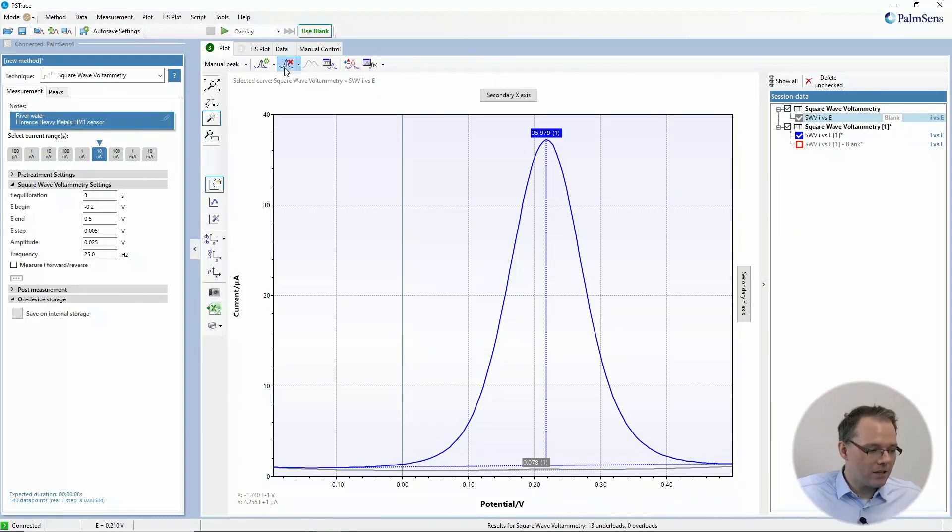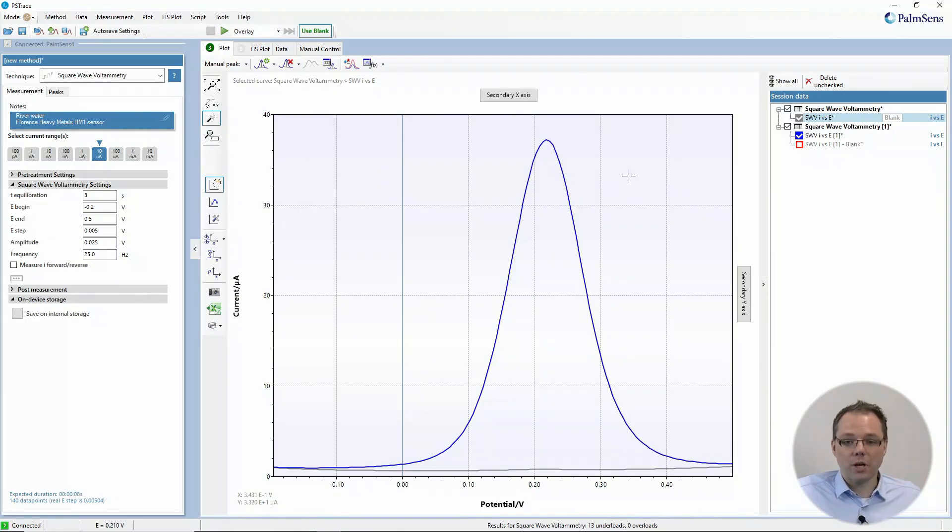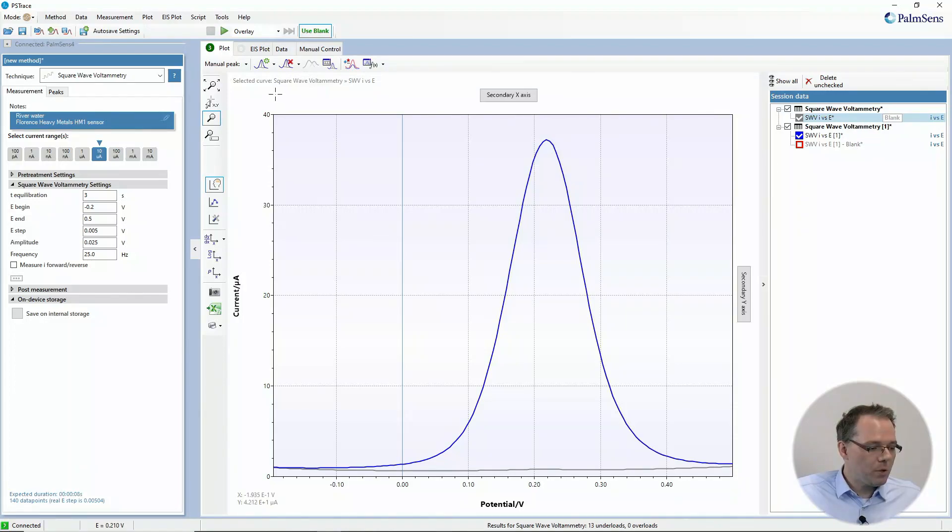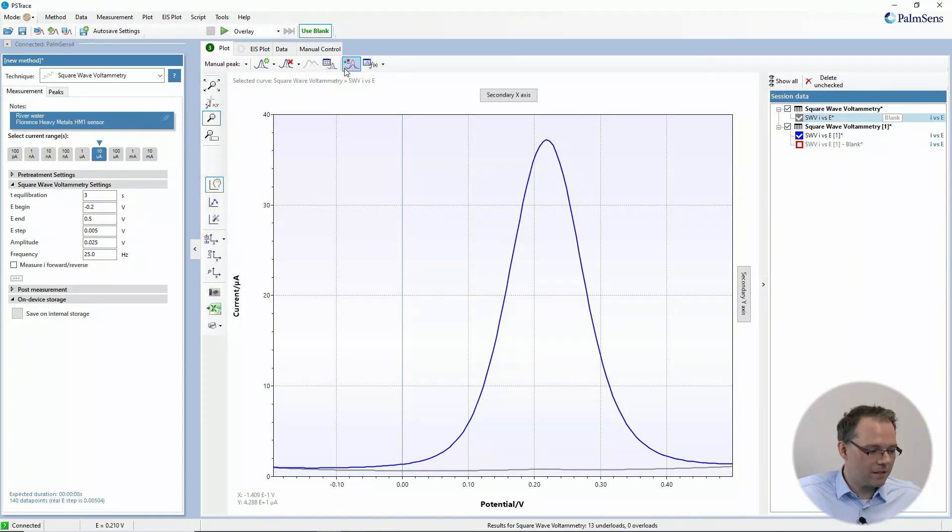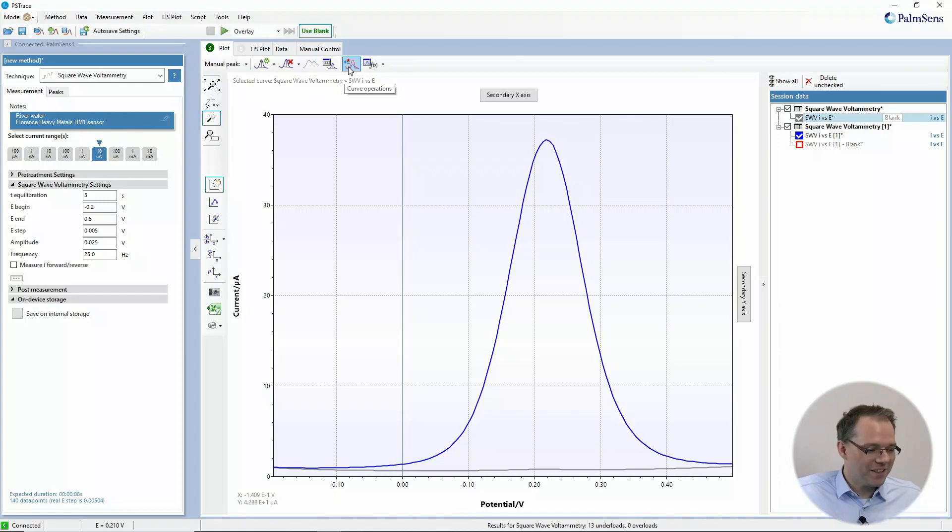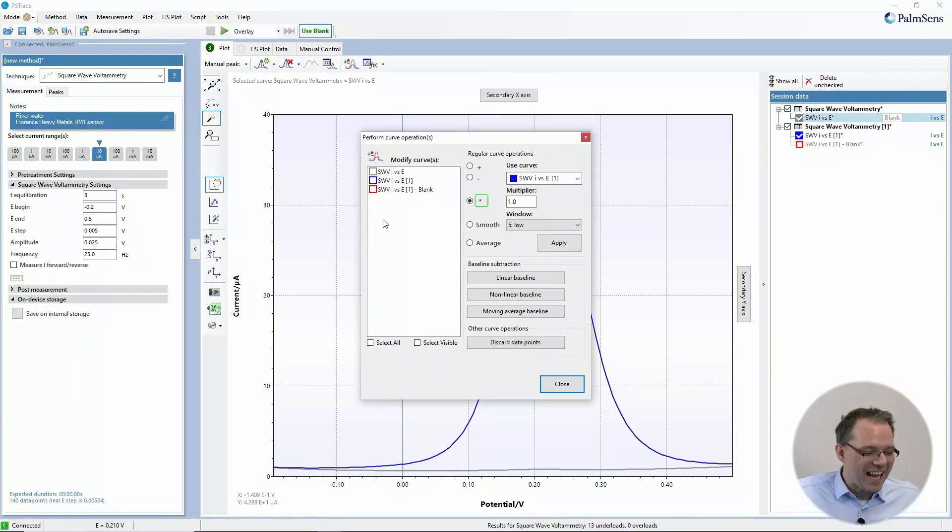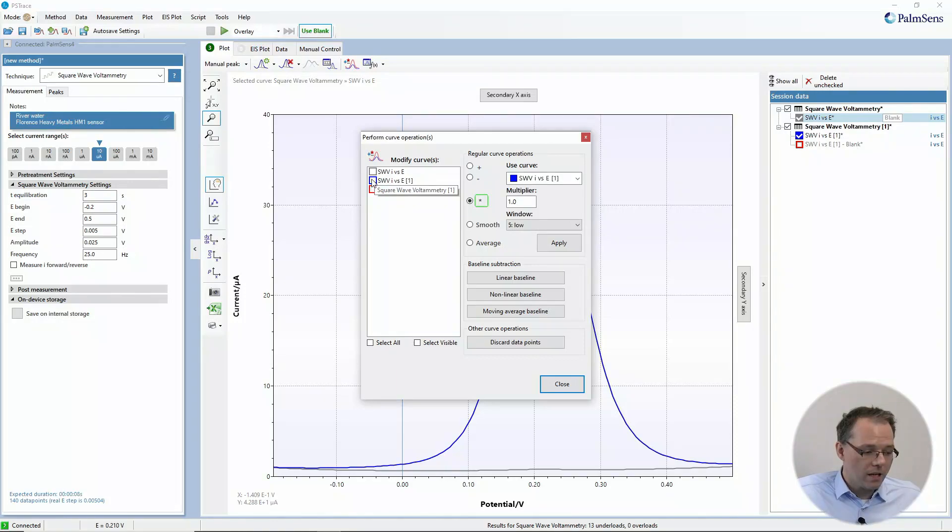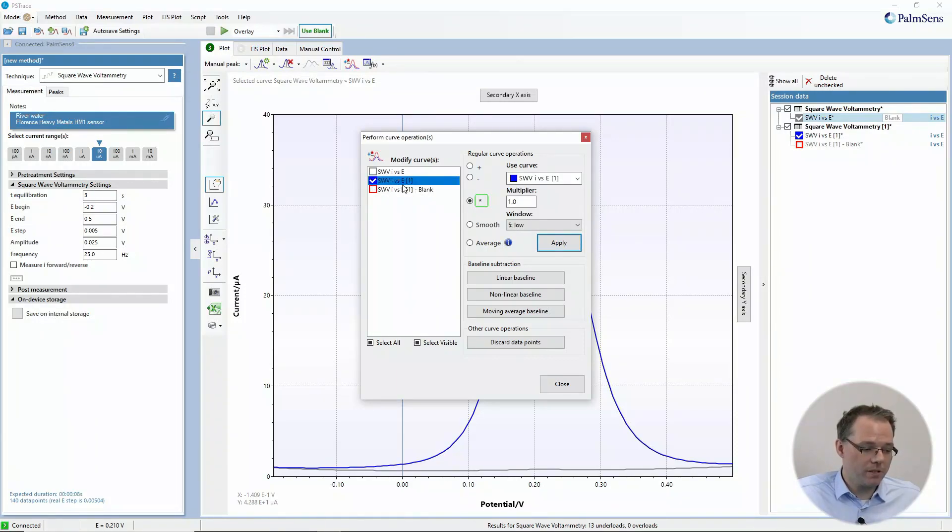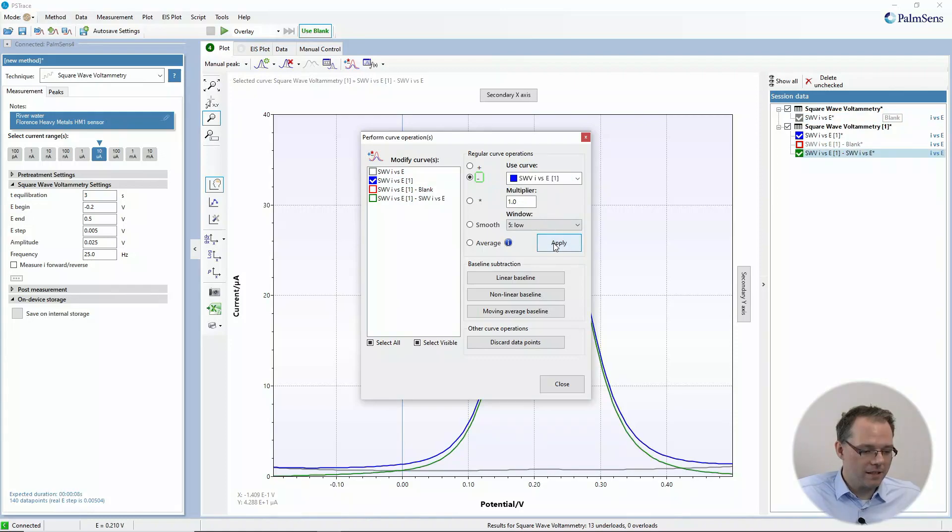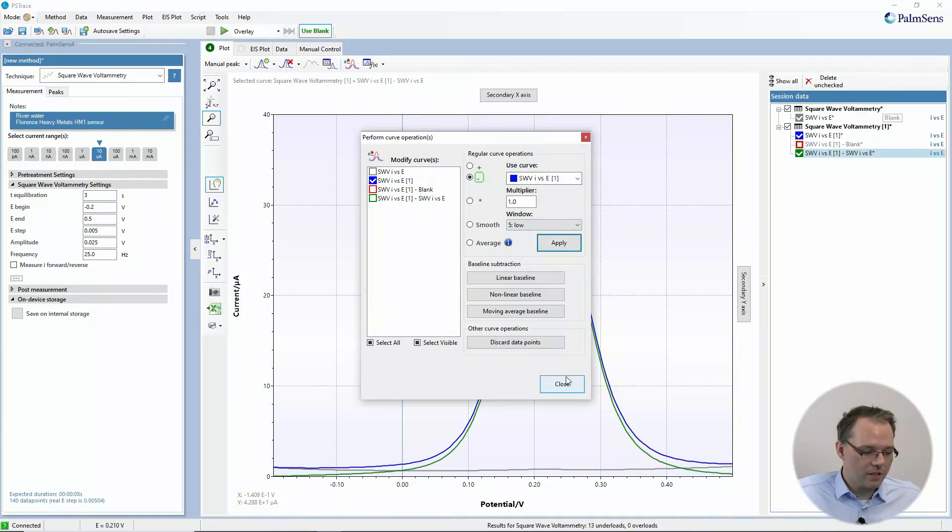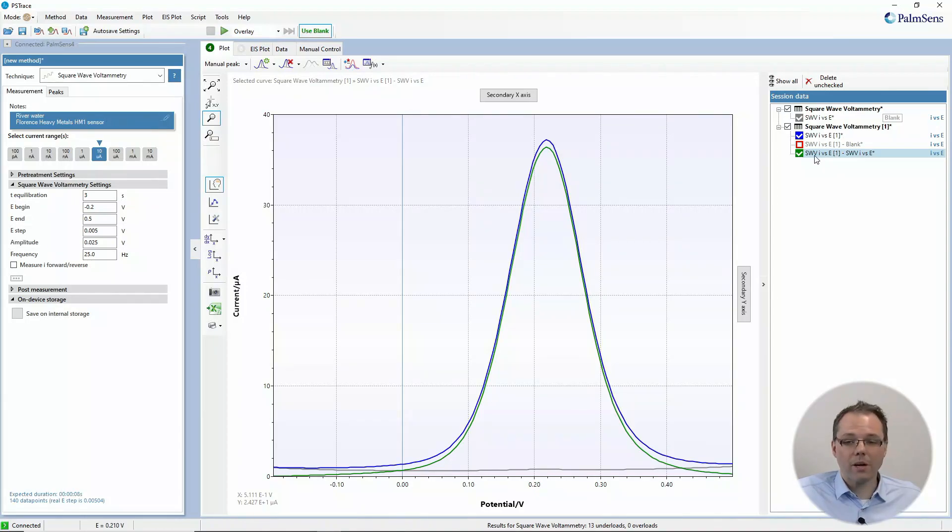But you have not made an automatic blank subtraction. You could go to the curve operations window and choose that you want to, from your original measurement, subtract the blank curve. Then you apply that, and you see now this curve appeared, which is my original curve minus the blank.